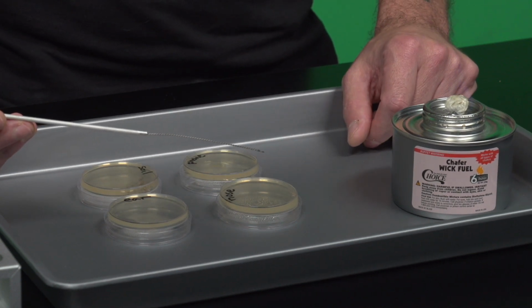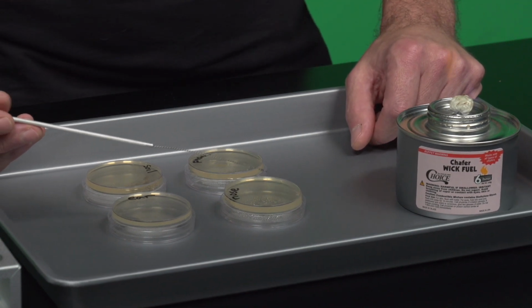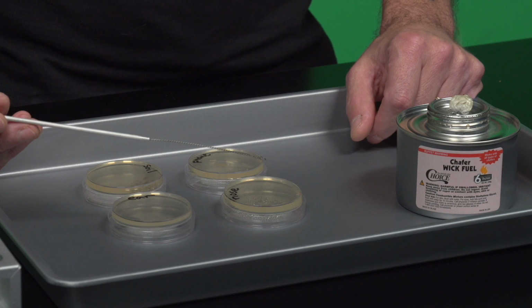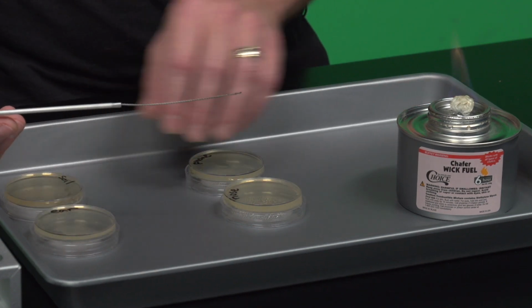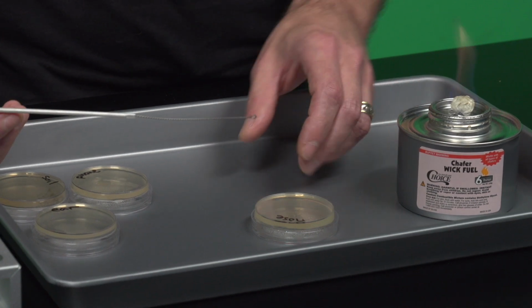Because if you take a super hot loop and put it to your bacteria, then essentially you'll kill a whole bunch of bacteria, which you don't want. So after you wait the 15 seconds, and it doesn't matter which one we start with, it is time to go ahead and do the quadrant streaking.